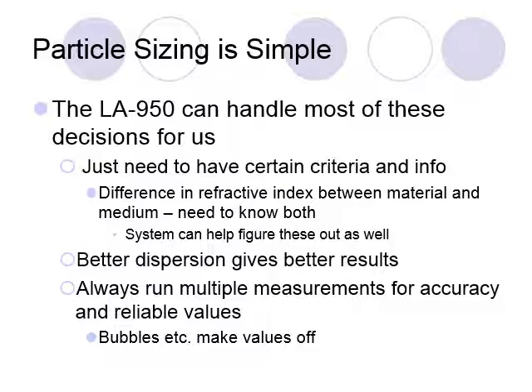Dry dispersion, you can do it in air, but obviously you need to make sure you have enough pressure to break things apart. Wet dispersion, you need to have the right vehicle, the right dispersant medium. You might have to add things like surfactants to help it. You really need to get the particles well dispersed. You can't have things that are partially floating, reacting. So you really need to double check what you're doing beforehand and discover some of this.